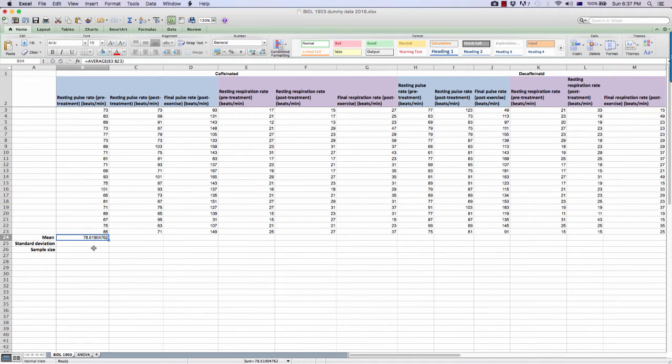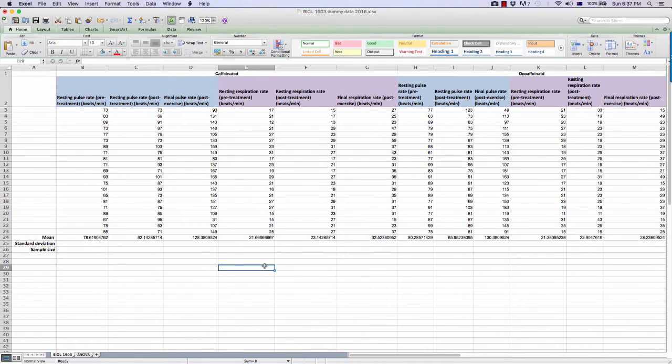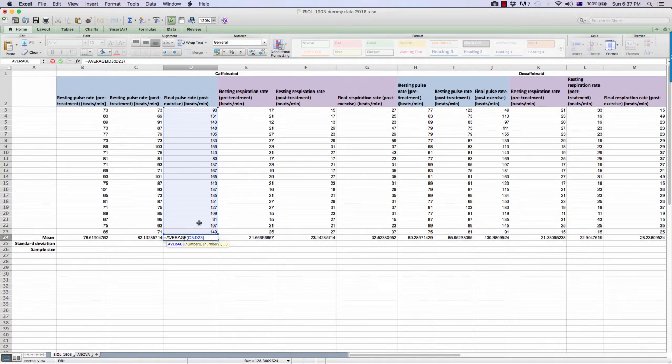Alright, so click on the cell that just has this calculated value and hover your cursor over the bottom right hand corner, and you'll see this black cross show up. Then drag the formula across to the end of your table. And when you select on any of these newly calculated values, you realize that Excel has calculated the mean for each column.